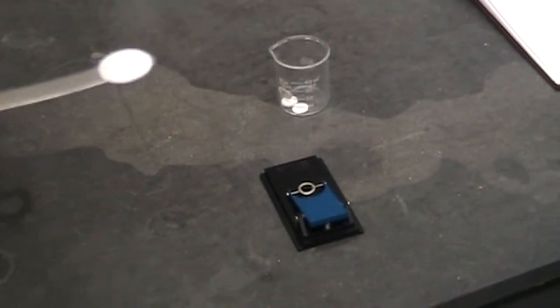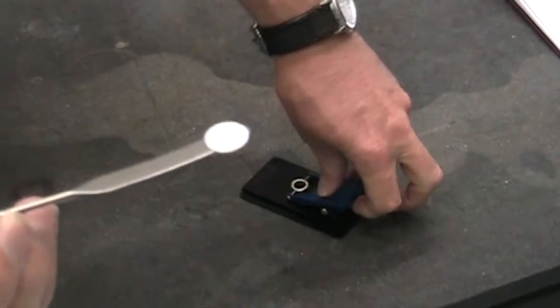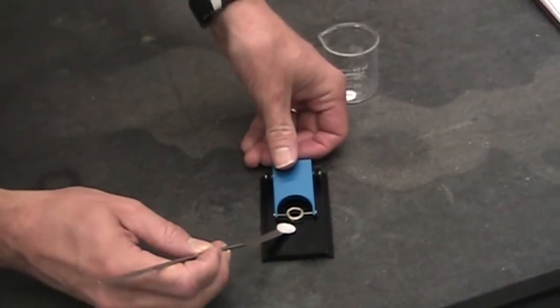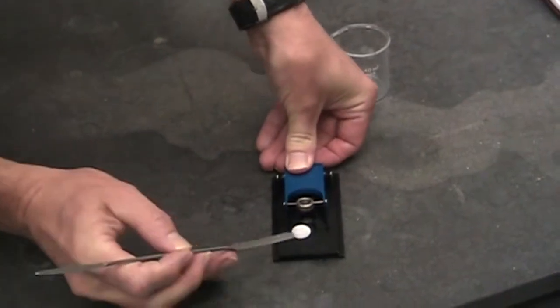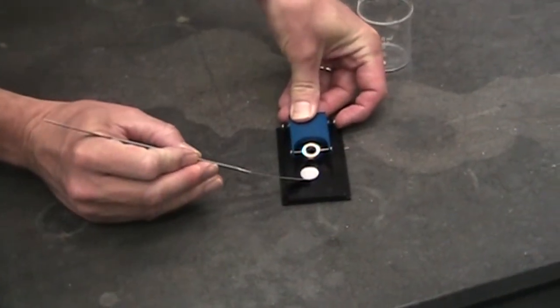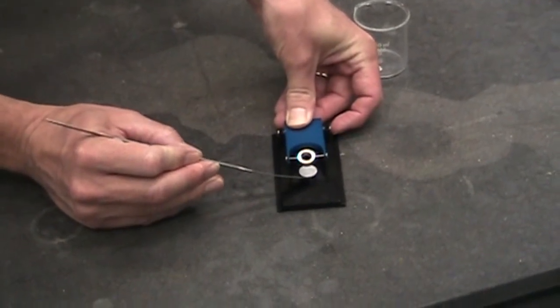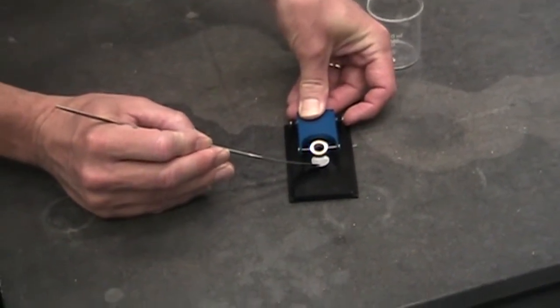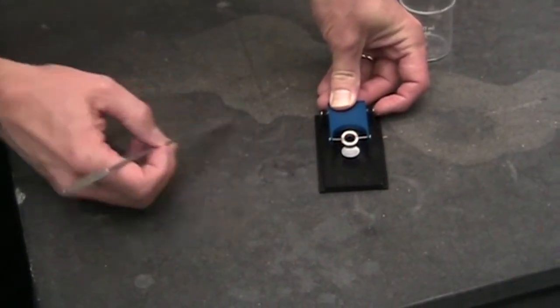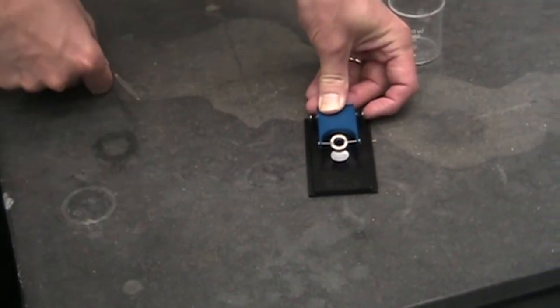I've got it on a spatula. You could put it on a piece of weighing paper. Again, the idea would be somehow manipulate it. Sometimes these can be pretty fragile. I'm just going to set it down. I'm going to lift the spring. It's a good spot for you. And then I'm just going to slide it in. And it's actually the same size as the hole here. Okay, and so it actually fits down slightly into a groove. That's the right size.